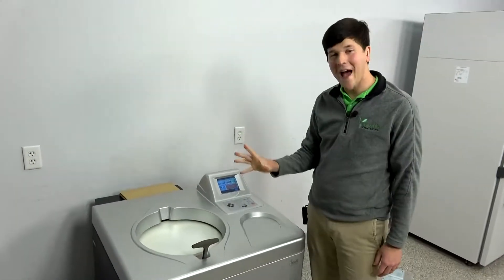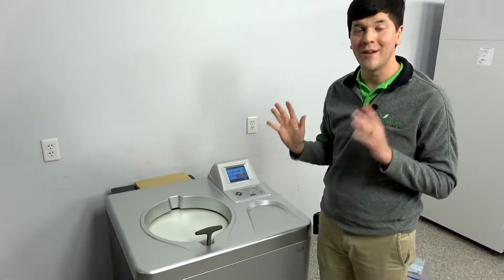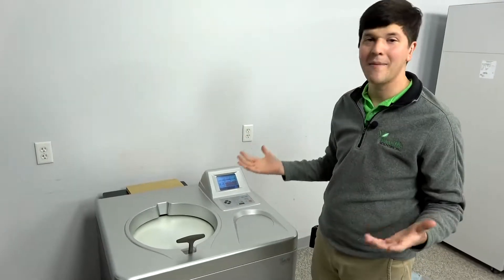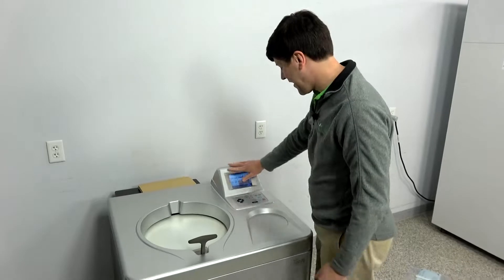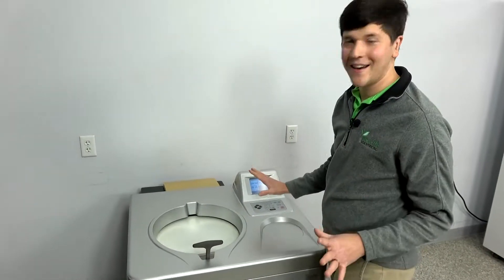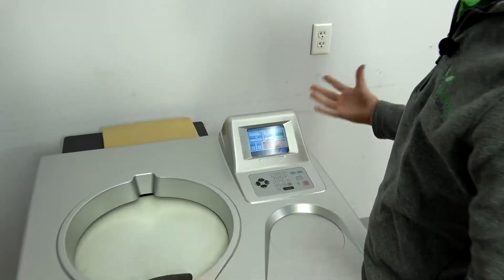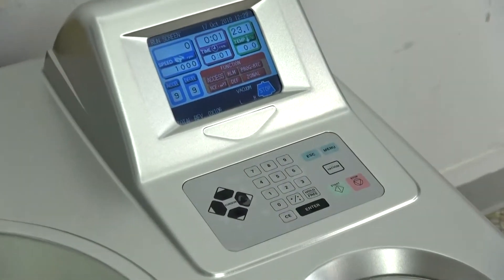The largest capacity rotor that works in this centrifuge is a 250 milliliter by six holder, so you're going to get about one and a half liters out of this machine. You've got an LCD screen with buttons — it's not a touch screen, but you have all of your operating information displayed there.